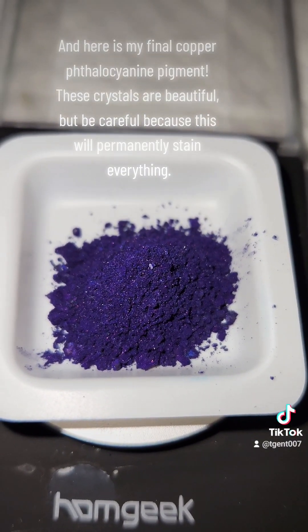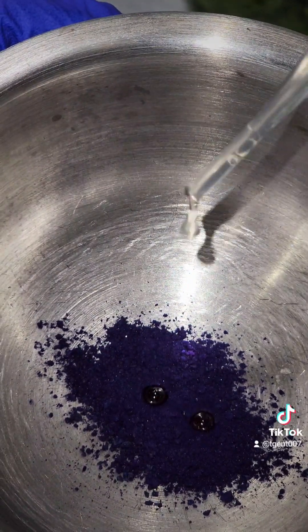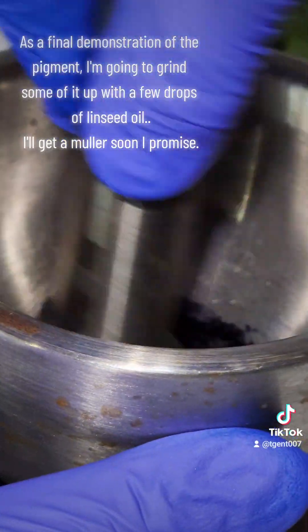These crystals are beautiful, but be careful because this will permanently stain everything. As a final demonstration of the pigment, I'm going to grind some of it up with a few drops of linseed oil.